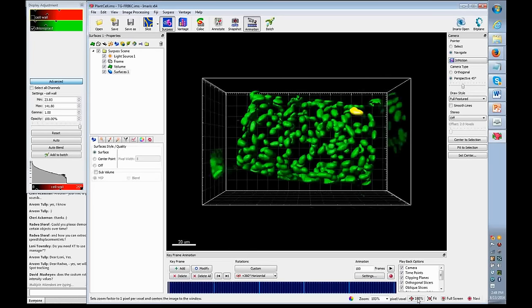Here again, you have to estimate the object diameter. The default is just a multiple of your voxel size. So whatever 10 voxels is, Imaris is going to guess that your objects tend to be around 10 voxels wide. So it could be way off, and don't worry too much if it is way off your actual object size. In this case, they're probably closer to around 6 microns if we look at them in an individual slice. So I'll go ahead and put that in.